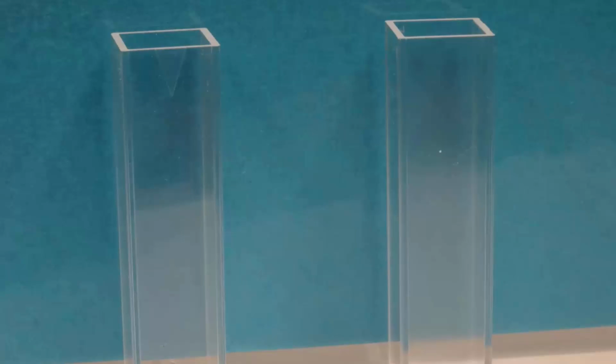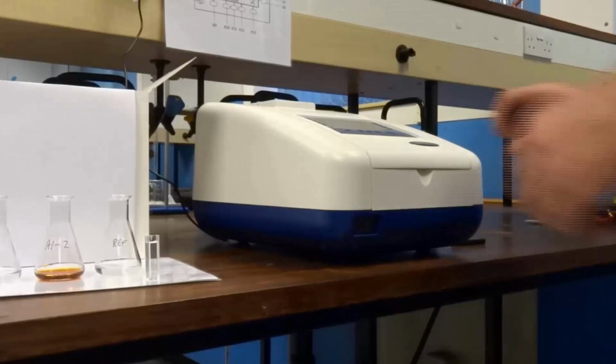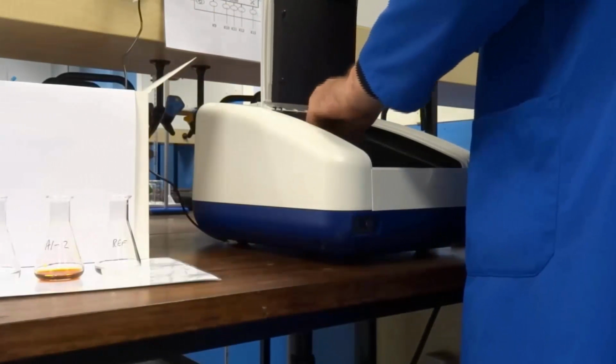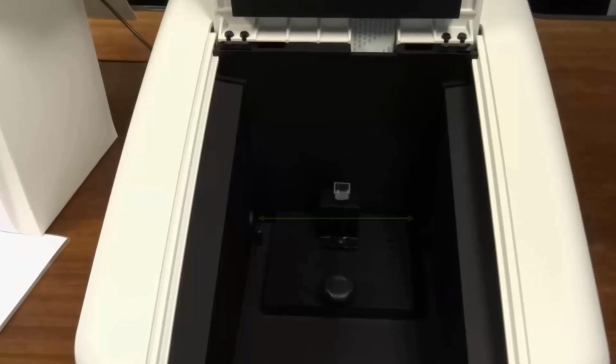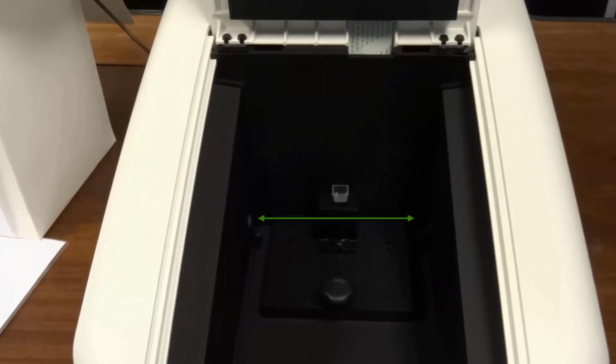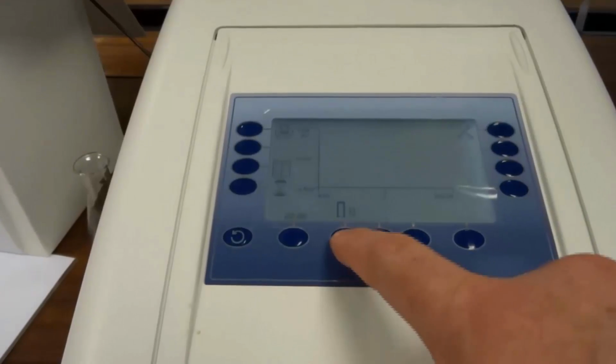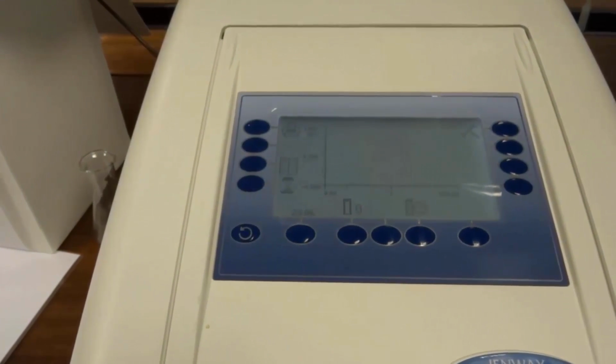Note that the cuvette has a clear side, which is marked by an indented triangle. We do not handle the cuvette by these clear facing sides. These are the sides that will face the beam, and we don't want our thumbprints distorting that beam as it passes through the cuvette. So carefully handling my cell by the sides, I place the cuvette in the instrument. The UV visible beam in the instrument runs parallel to the bench, so I make sure my clear sides are facing that beam. We close the lid of the instrument and press the zero button on the instrument.